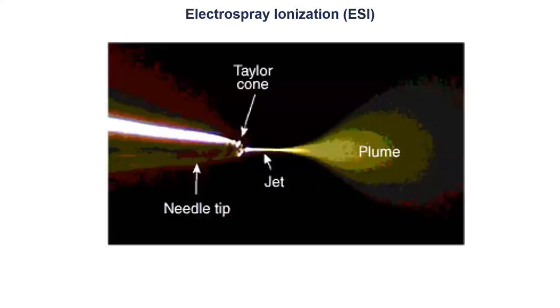And one thing I want to highlight is, in the past we used GC as this was the first method that we had. And the problem that we had in the past was, how do we get the solvent phase into a gas phase, right? So it was a big issue. It wasn't so easy to put a liquid into our mass spectrometer. And this is why electrospray ionization was developed. Here we actually dry the liquid that is coming from the column entering our system. So we have this needle here. We have different gases to dry it. We have a voltage. And then based on this, we get the charge and smaller droplets evaporating even more. And then we get it into our mass spectrometer in the end.